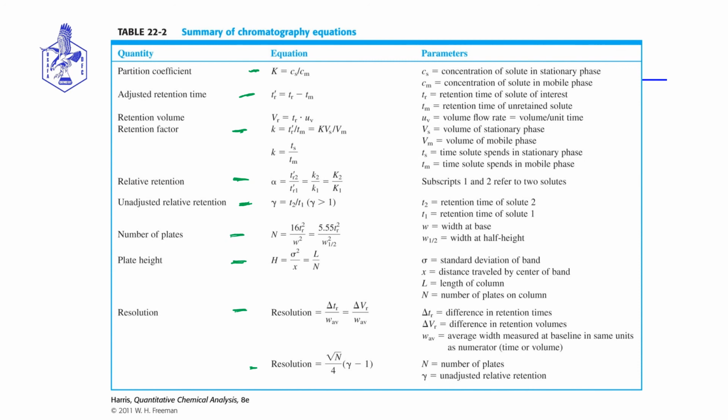So this ends our introduction to separations and the fundamental aspects of carrying out a clean separation. And the next lessons are going to focus specifically on the methods of HPLC and GC.